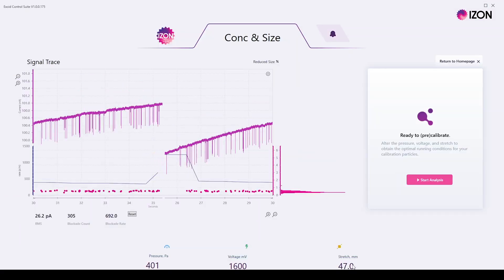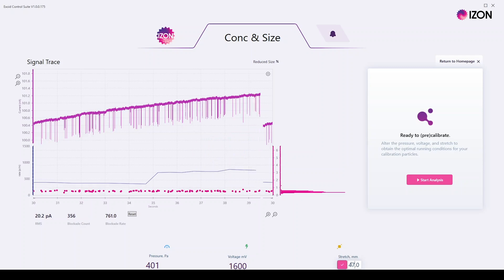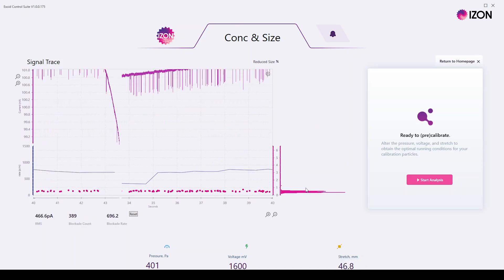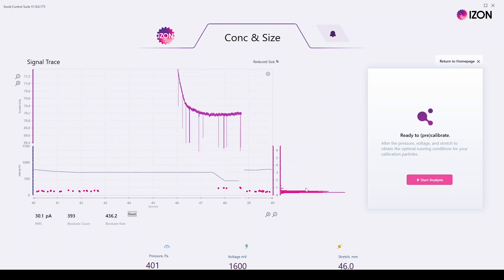The change in signal observed is different for each nanopore. For example, when changing the stretch from 47 to 46 millimetres, the last nanopore changed the blockade size by 0.1 nanoamps, however on this second nanopore the blockade size changes by 0.3 nanoamps.